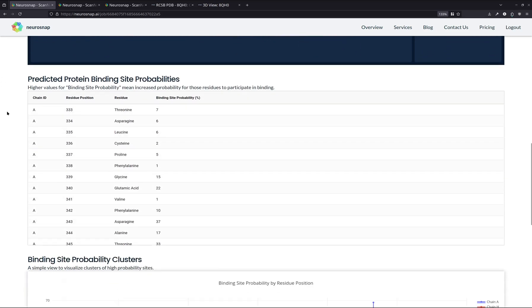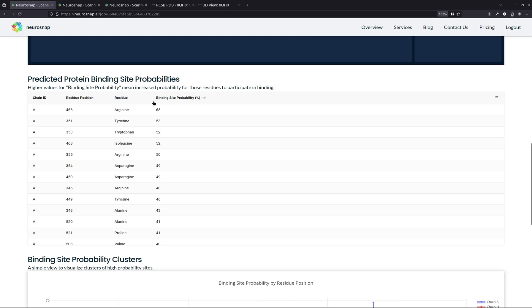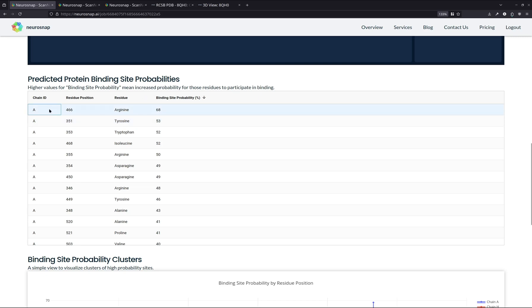Now the next table that we want to look at is right over here. And essentially you can use this to find out which residues have the greatest binding site probabilities. As we can see, residue position 466, which is an arginine, has a really relatively high binding site probability of 68%. Now this is pretty high, all things considered, but it could also be a false positive. So to actually determine whether or not something is a false positive, a couple things that I personally look for is the proximity of other residues that also have very high binding site probabilities.